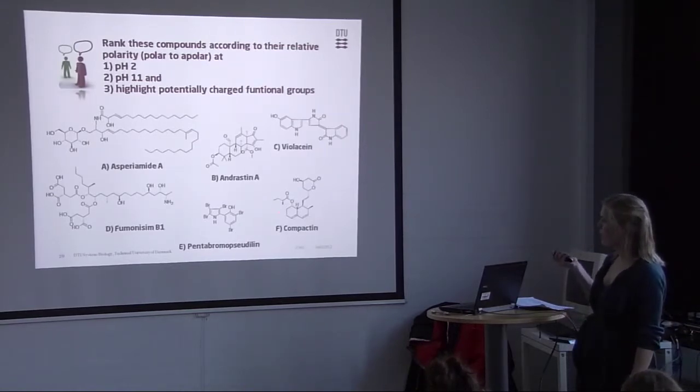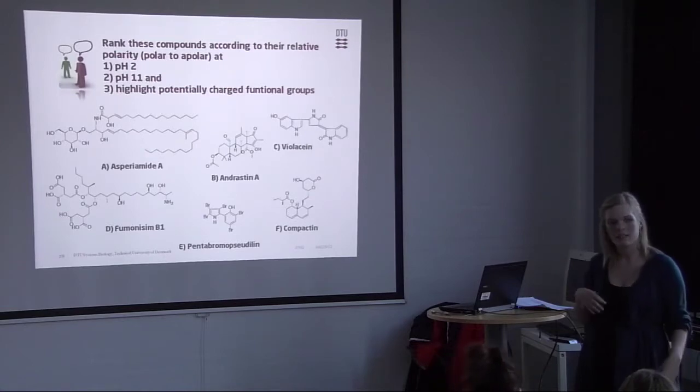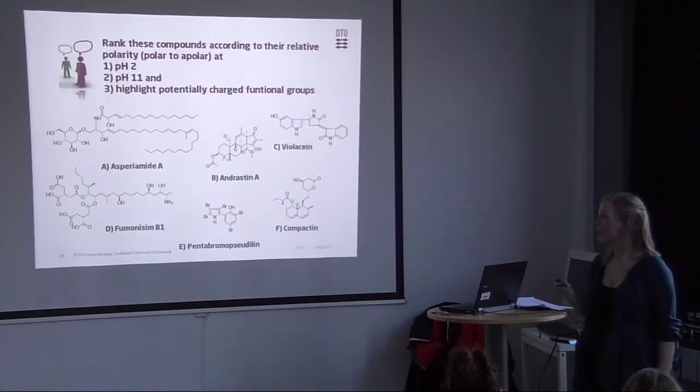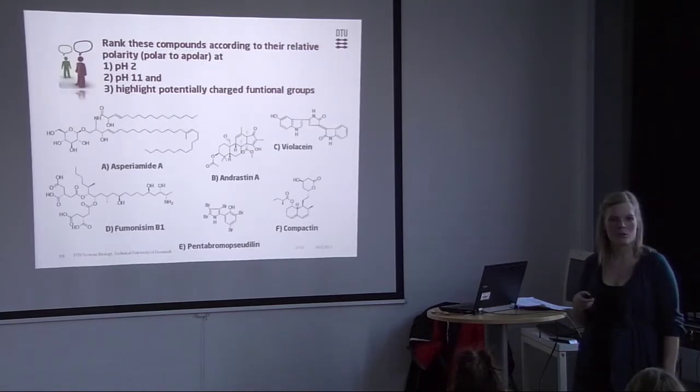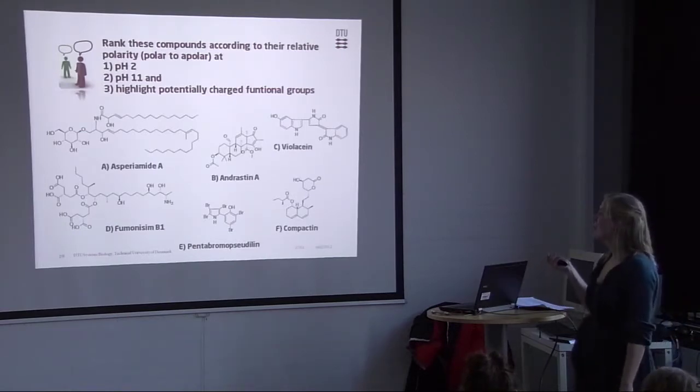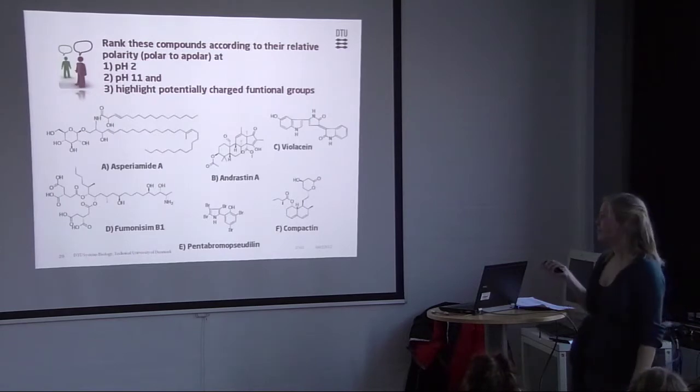Then we got a compound here. It does not have any groups that can carry a charge. It won't be affected by changes in pH. So it will lie in the middle, more or less, no matter what you do. Where exactly in the middle is not the point of this exercise. But it will be unaffected.